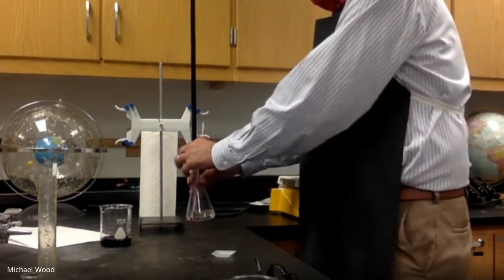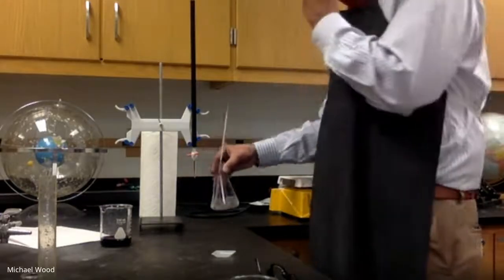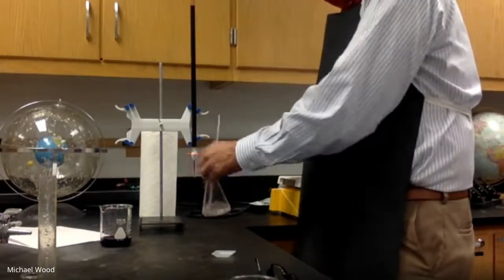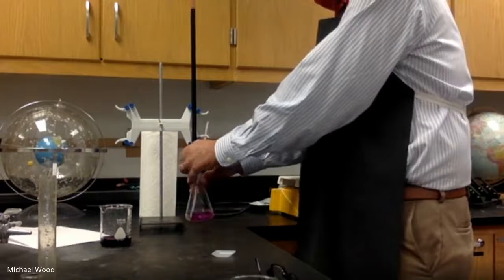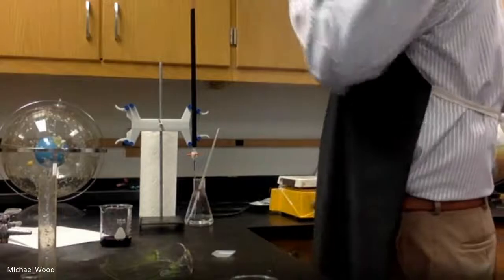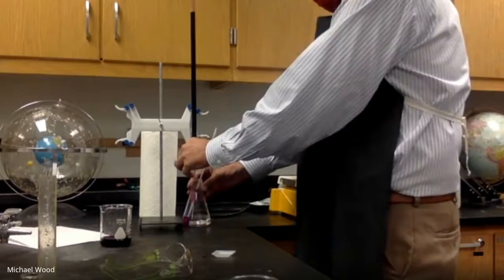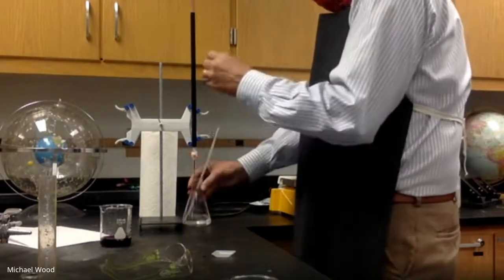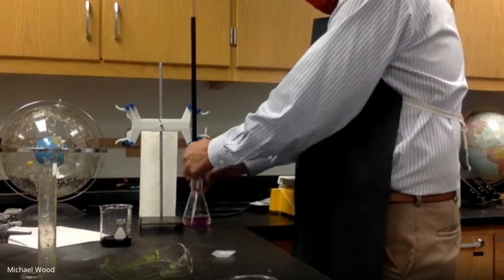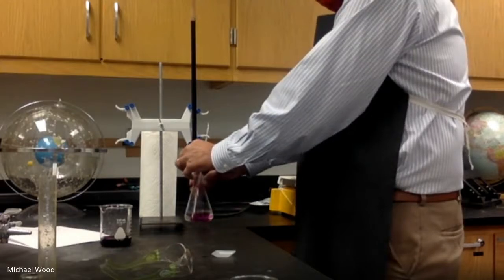Chemistry is colorful. You guys can see that the color continues to go away. And I want to look for myself. I need my glasses on. Okay, I still think I need to add a little bit more, because I think I need at least 25 mils, and I'm not quite there yet.